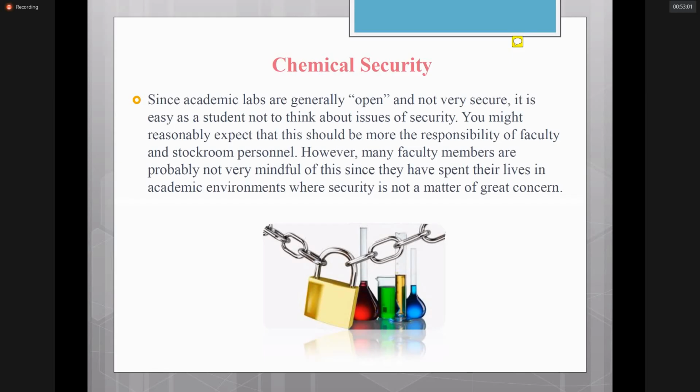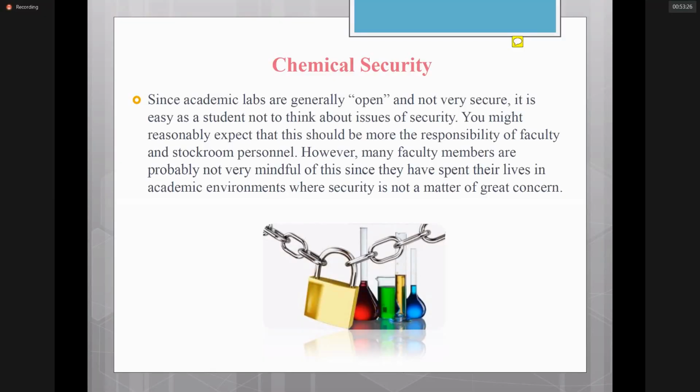الآن بعد الليكتشر أن نعلم أن الأكسس للكيميكال كابينت أو الكيميكال ستوك روم غرفة التحضير المواد الكيميائية are certain access for special personnel مثل الأستاذة فنية المعمل أو أشخاص متخصصين في الدخول لهذه الكابينت أو أماكن التخزين.